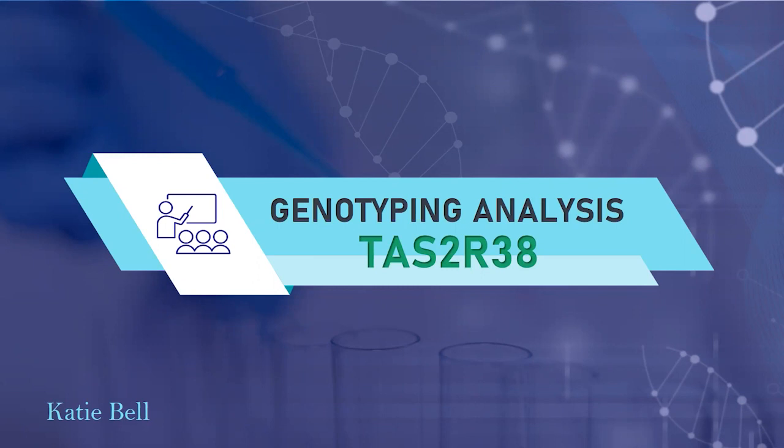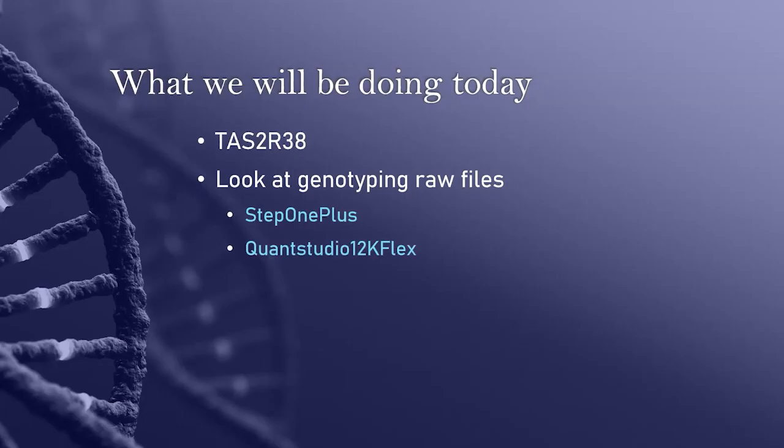This is one receptor with its own little video for analysis, which may seem like a lot, but in fact, the methods for this type of genotyping are a little abnormal to your day-to-day SNP analysis. If none of that's really resonating with you, that's totally okay, because I'm about to go through everything, so you're in the right place. So let's get into a little overview.